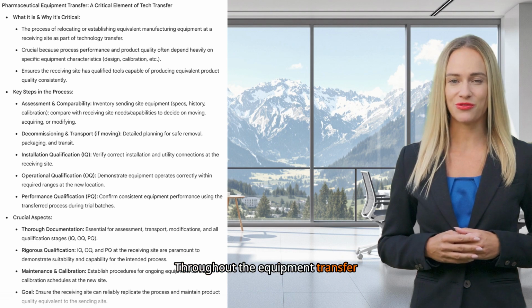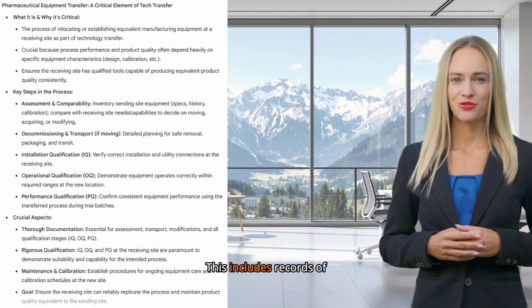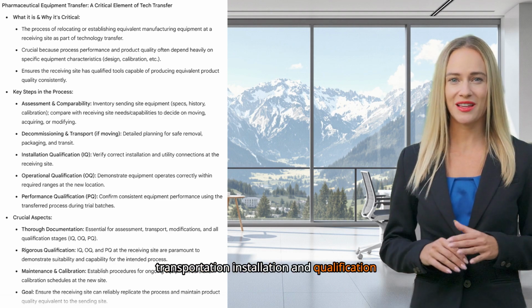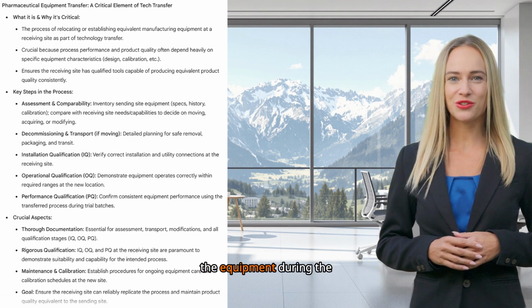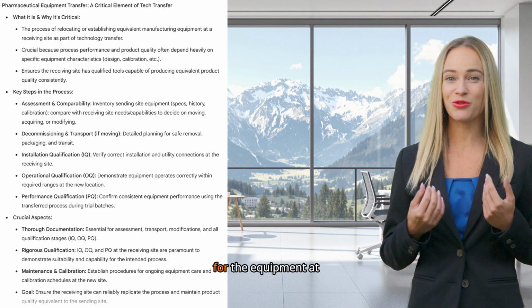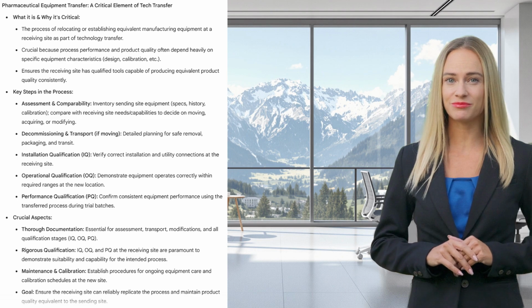Throughout the equipment transfer process, thorough documentation is essential. This includes records of the equipment assessment, decommissioning, transportation, installation, and qualification activities. Any modifications made to the equipment during the transfer must be documented and justified. Calibration and maintenance procedures for the equipment at the receiving site must also be established.